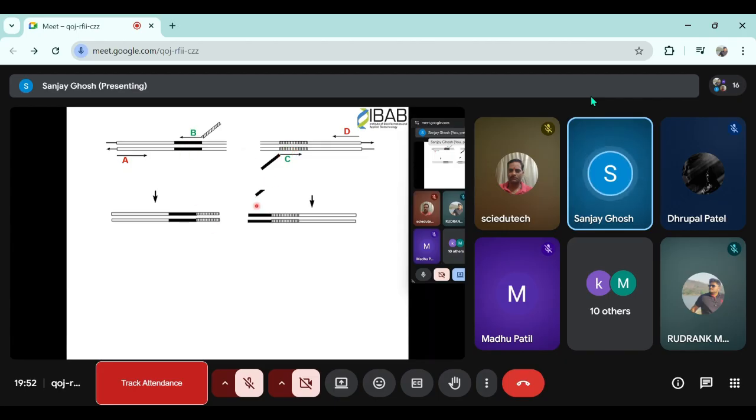the previous fragment. If you do a PCR, what will happen? You will get this situation. You will have this part followed by directly this part, right? Which is shown in, so one part is a solid black box and the other one is striped. So the striped part will be made here. This is your PCR fragment. If you use this chimera, then you will make a solid black as well as this chimera, right?